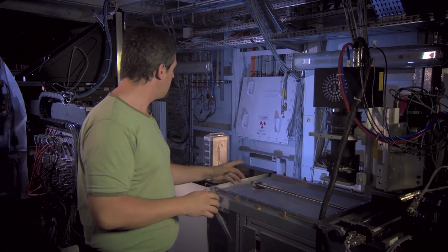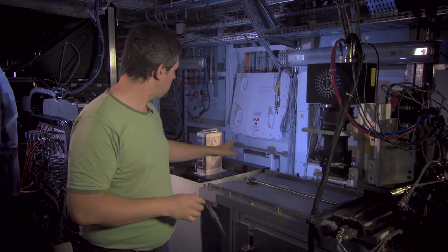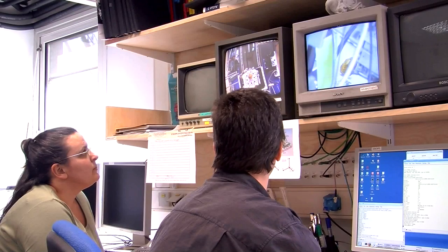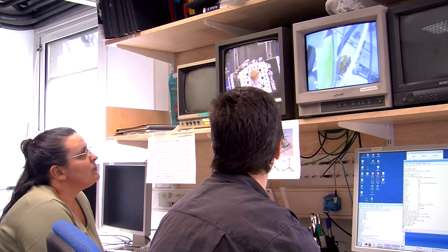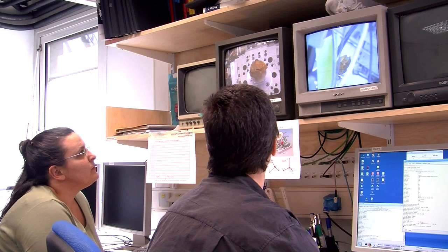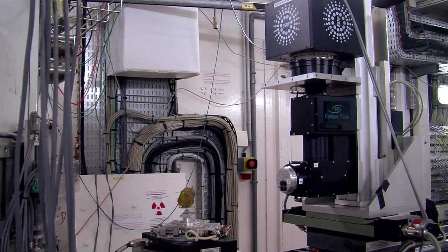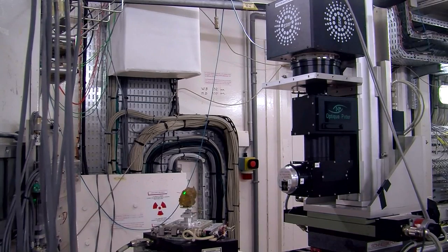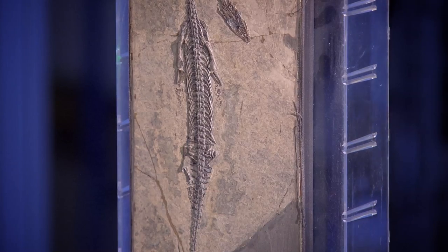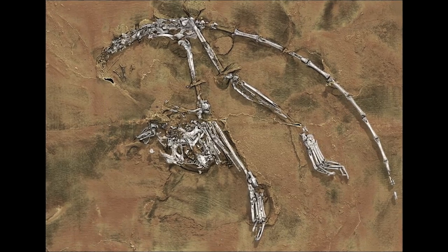For microtomography, at each angle we make a radiograph as the X-rays pass through the sample, creating what we call the phase contrast effect. Then we rotate the sample and make around 2,000 projections — 2,000 radiographs during the full rotation. Using all these radiographs, algorithms reconstruct virtual slices, and when all the virtual slices are combined in a 3D system, you get the virtual reconstruction of the sample with all its internal anatomy.